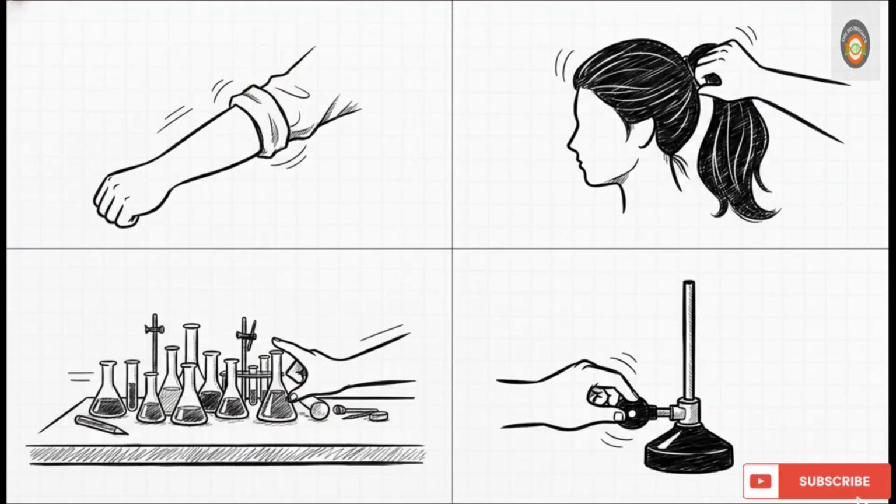Okay, now that we have perfectly thinned out samples, our final challenge is spreading them out safely. And before any biology happens here, we have to talk about safety, because we are literally about to play with fire and live bacteria. Microbiologist Stephanie Sweeteek outlines a really rigorous checklist. You must fasten all loose clothing sleeves, you must pull your hair back completely so you don't accidentally ignite yourself while leaning over the bench. You've got to clear your workspace of clutter and absolutely ensure the gas line is entirely off when your Bunsen burner isn't lit. We definitely don't want the room filling up with flammable gas.